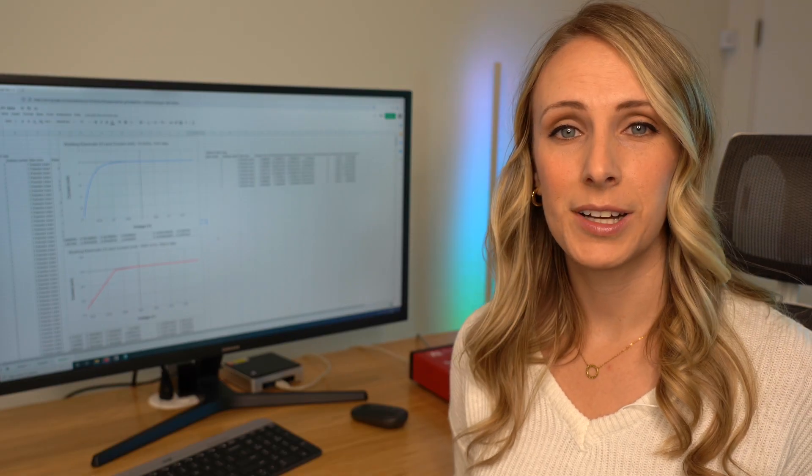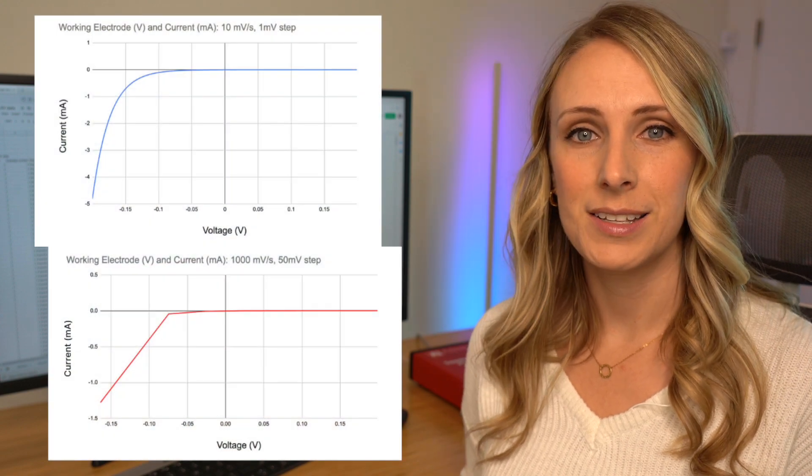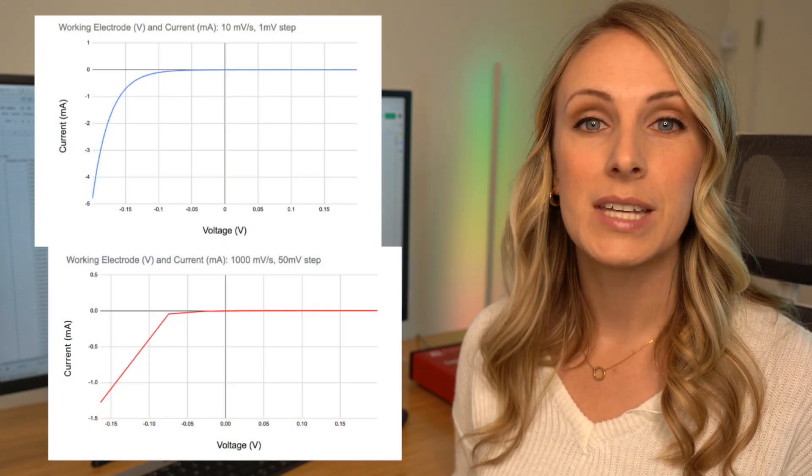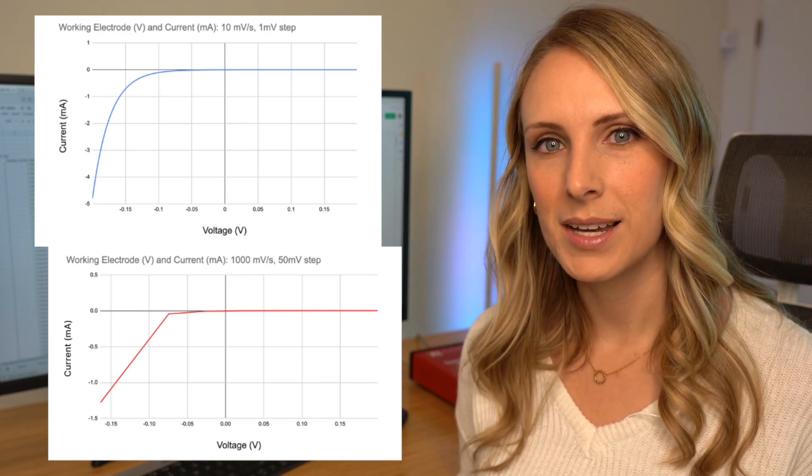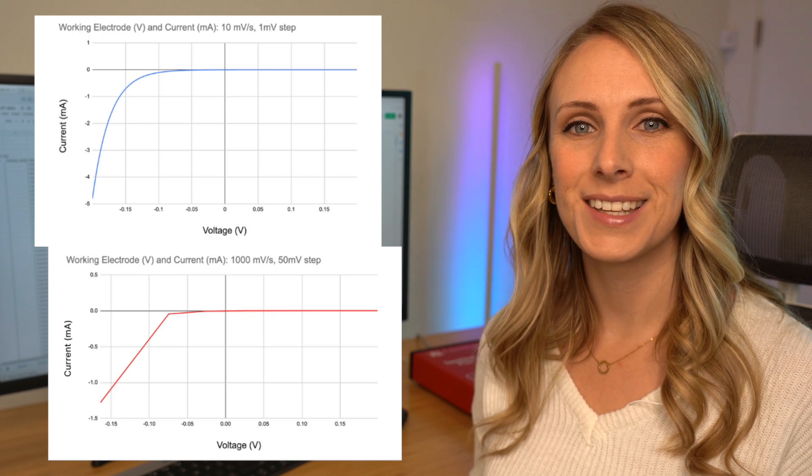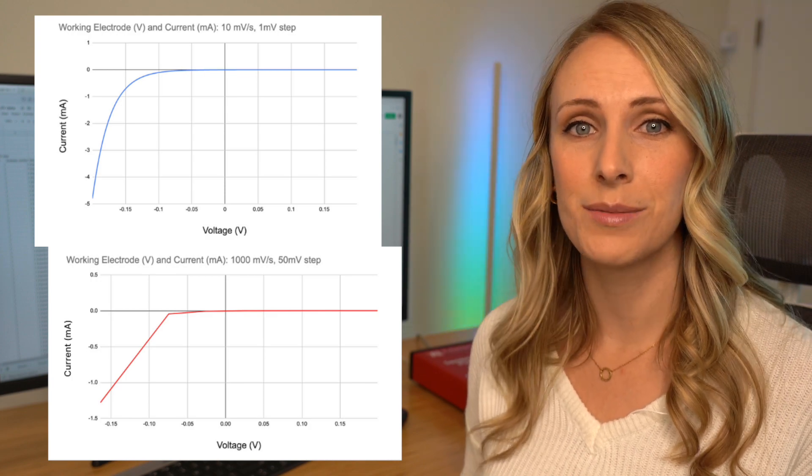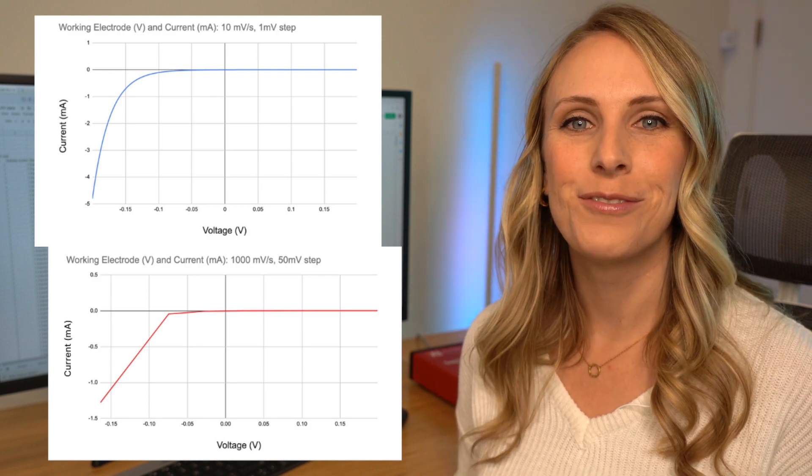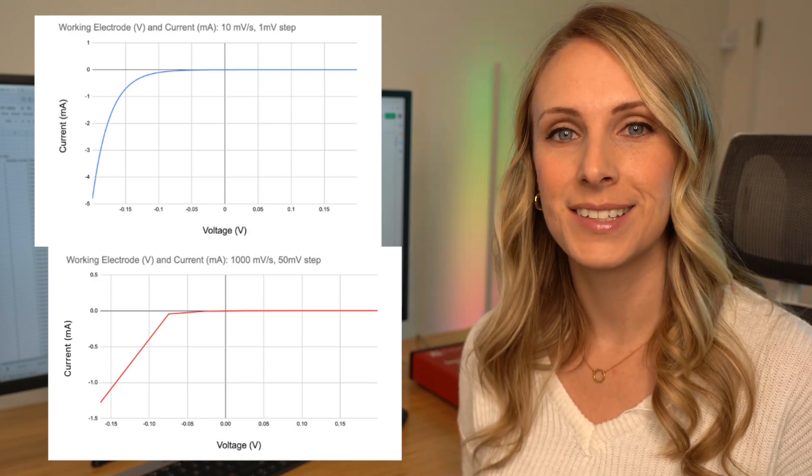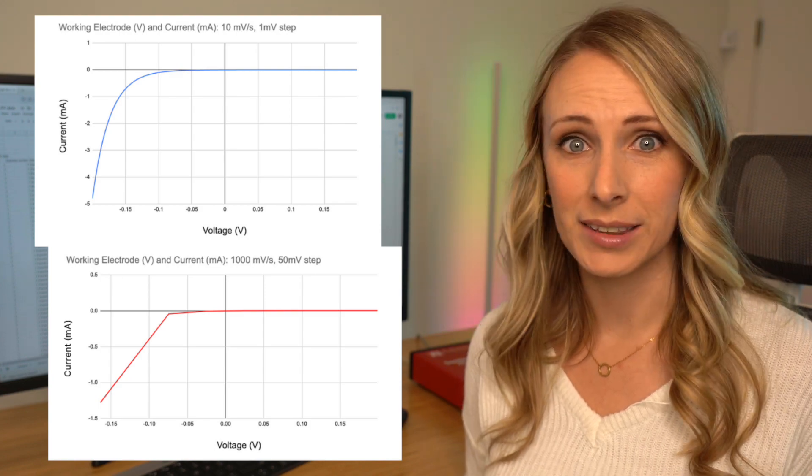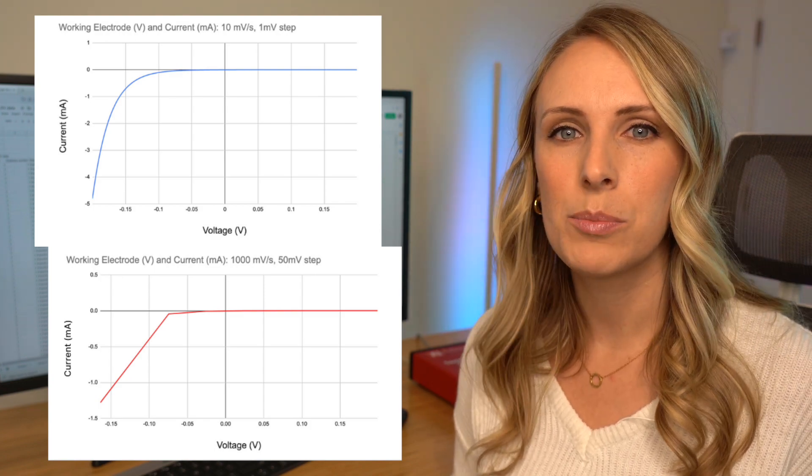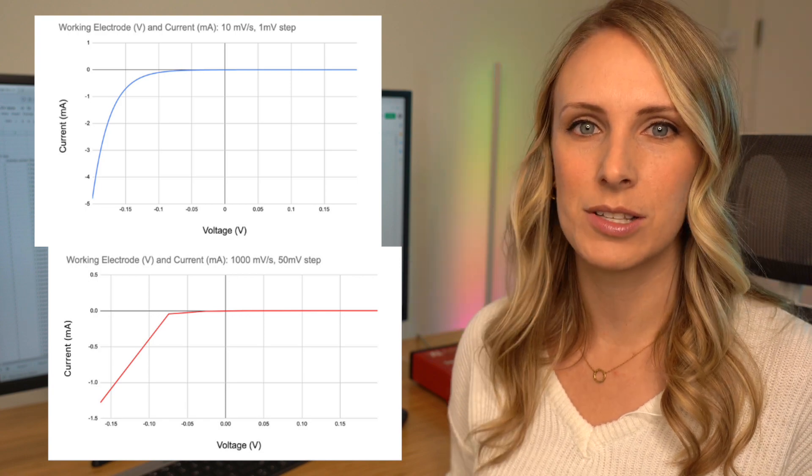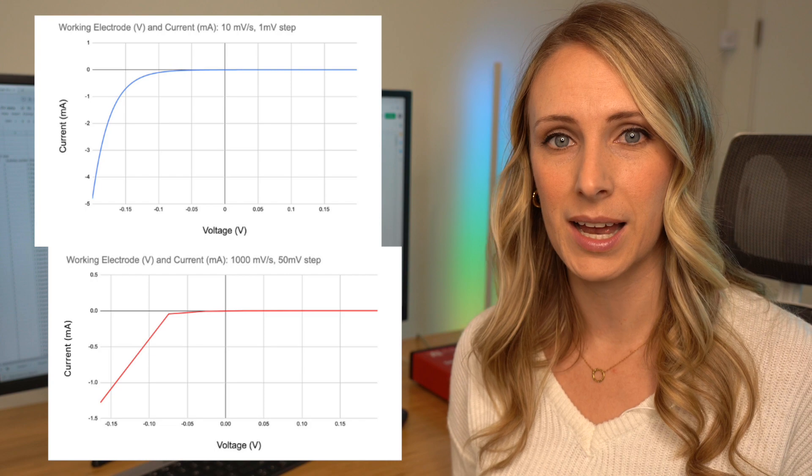Now this again just with 50 millivolt steps you swamp out that beautiful curve that we saw when we used a slower scan rate and a smaller step size. Let's take a closer look at the data we just acquired. The blue line in this top graph is that slow scan rate of 10 millivolts per second with the small step size of 1 millivolts and then in the red line you can see the data for the 1000 millivolts per second scan rate super fast and the 50 millivolts step size. Obviously we're getting much better data with that blue line than the red line proving my point that if you want really precise data that high resolution data you want to use a slower scan rate and a smaller step size.